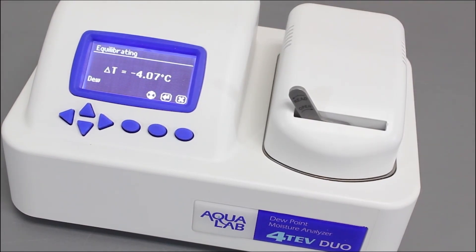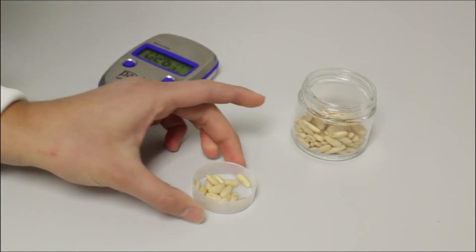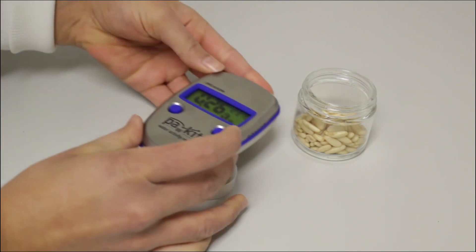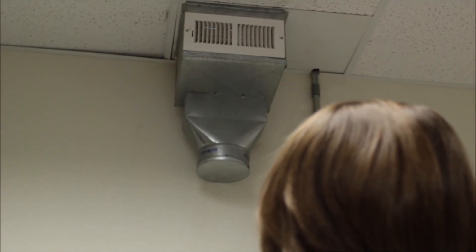These instruments also have temperature equilibration, which the Pocket and Light do not have. Since water activity is temperature dependent, taking readings at a consistent starting temperature is extremely important. If both the instrument and the sample are at ambient temperature, then you shouldn't have any problems. If the temperature of your facility changes frequently, then you could have problems with temperature. If you think you should be using a more accurate instrument, or you are interested in not having to account for temperature by having an instrument with temperature equilibration, please email us at sales@aqualab.com so we can discuss your options and maybe help you trade in your instrument.